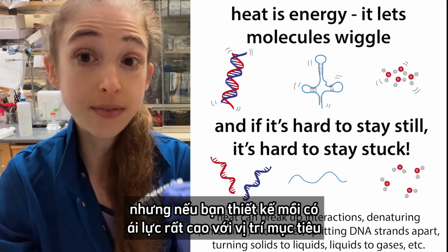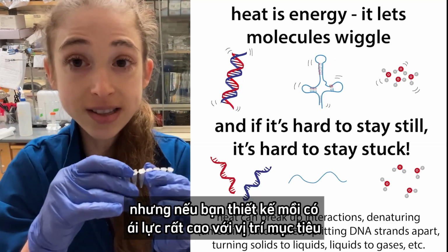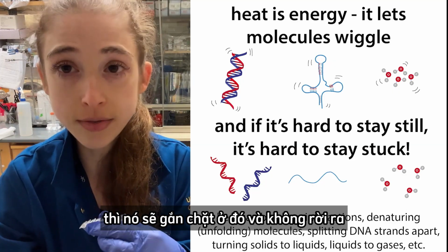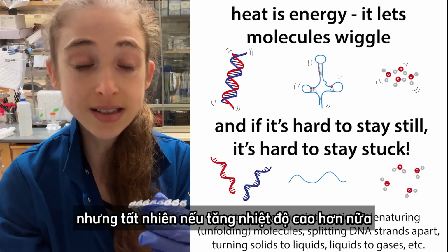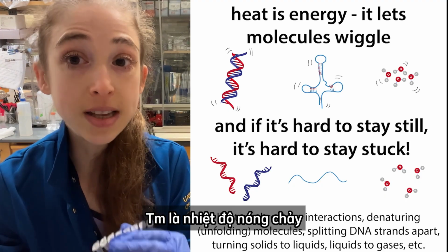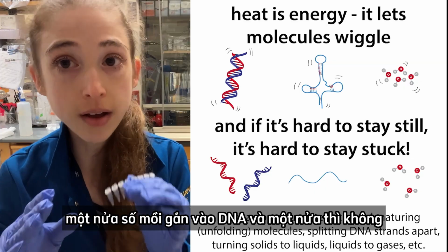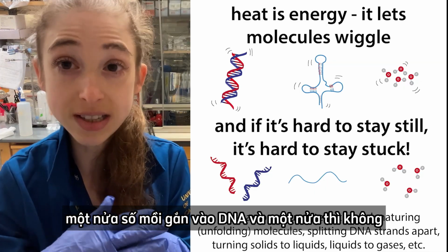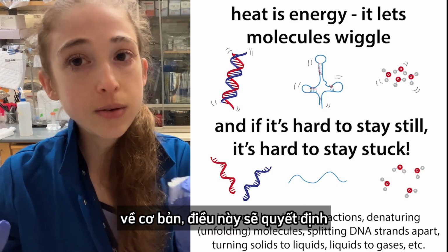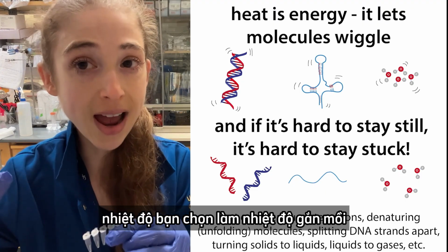But if you design your primer so that it has a high affinity for the site that you want, then it's going to get stuck there and it's not going to come off. Of course, if you raise the temperature even further, then eventually it would come off. The Tm is the melting temperature. This is the temperature at which it's predicted that half of the primer is going to be bound to the DNA sequence and half of it would be free. Basically, this is going to dictate what temperature you set the annealing temperature at.